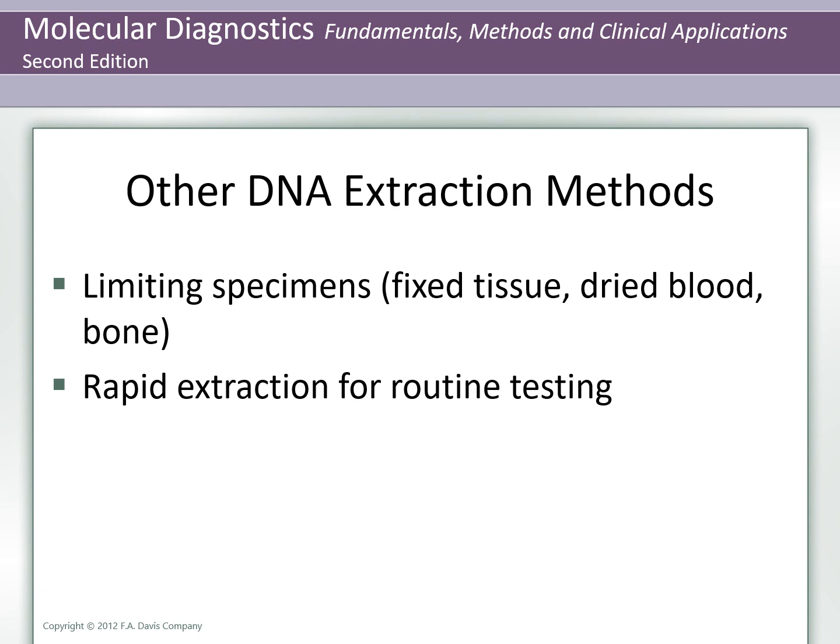Paraffin-embedded specimens must be dewaxed with xylene or other agents and then rehydrated before nucleic acid isolation. Before lysis, cells may be washed by suspension and centrifugation in saline or other isotonic buffer. Reagents used for cell lysis depend on the subsequent use of the DNA. For simple screens, cells can be lysed in detergents such as SDS or Triton. For use in PCR amplification, cells may be lysed in a mixture of Tris buffer and proteinase K. The proteinase K will digest proteins in the sample, lysing the cells and inactivating other enzymes. The released DNA can be used directly in the amplification reaction.